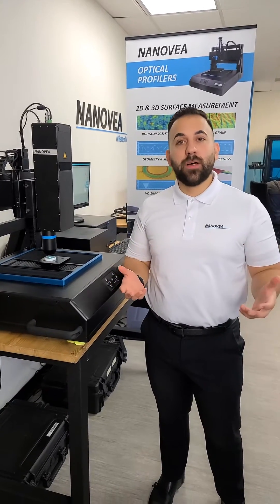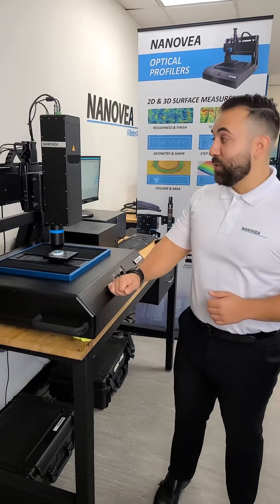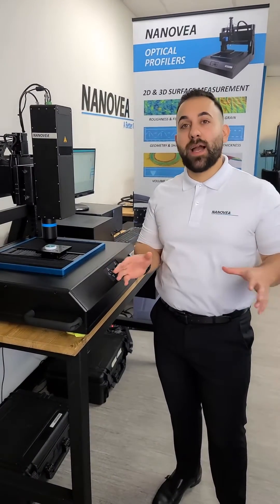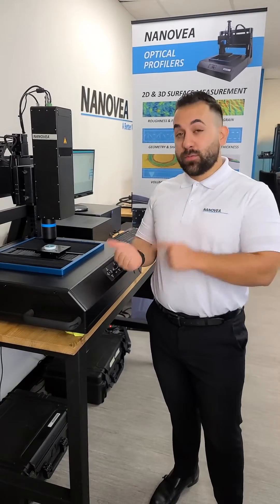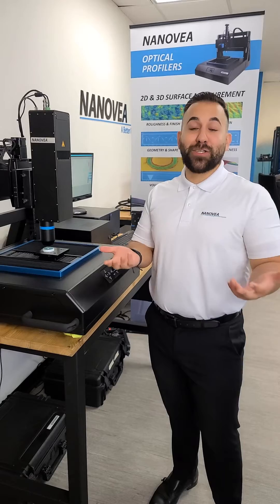Hi, my name is Adam. I'm from Nanovea. I'm standing right here in our lab in Irvine, California. I'm standing next to our ST400 line sensor, which is a white light non-contact chromatic profilometer. This right here is one of our most powerful and popular profilometers that we offer right now.